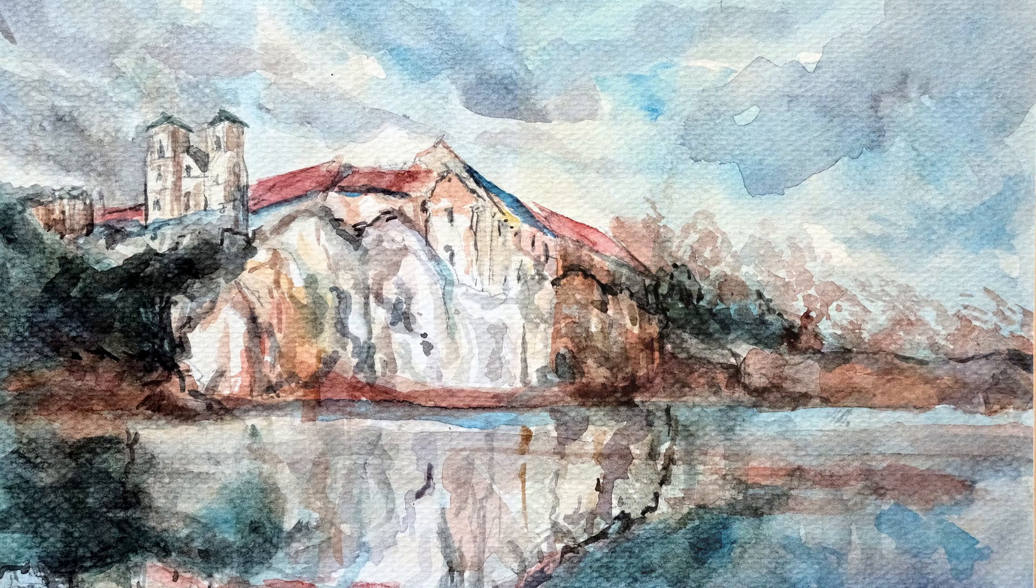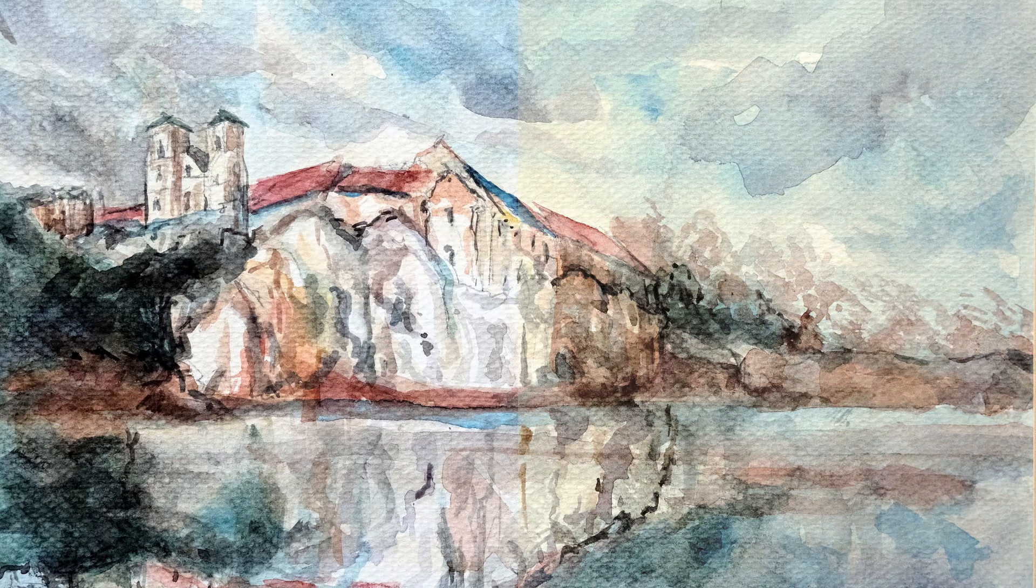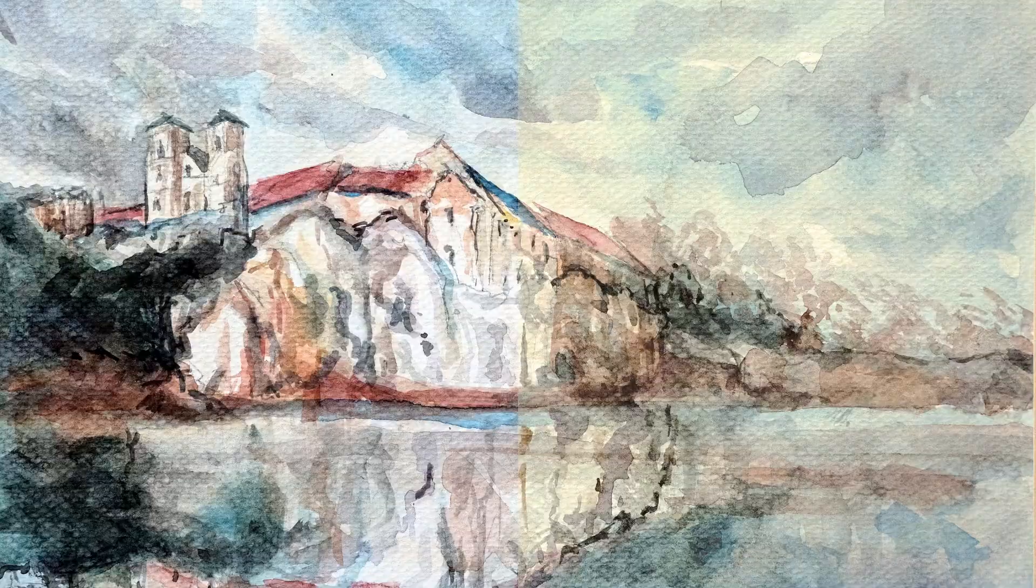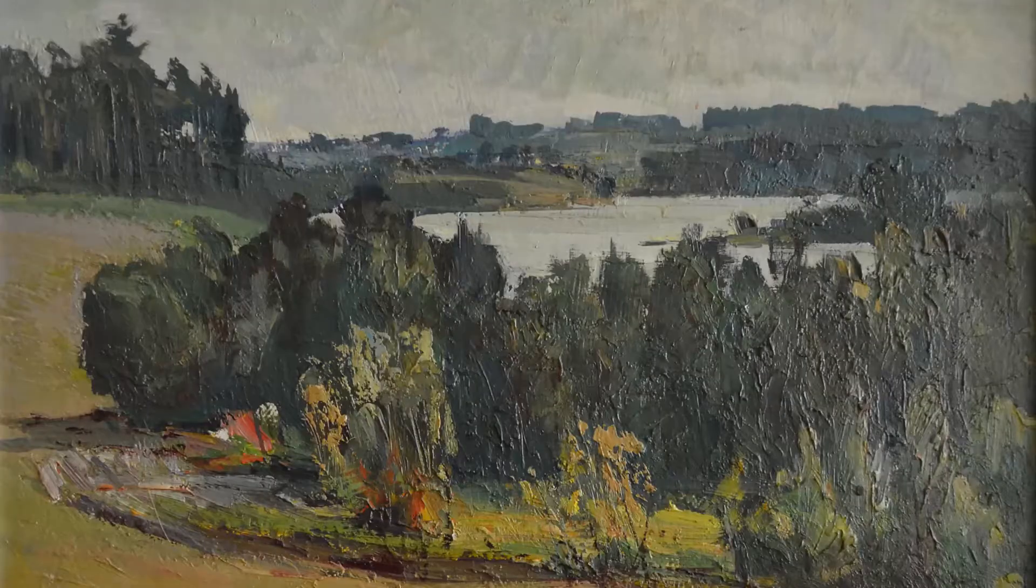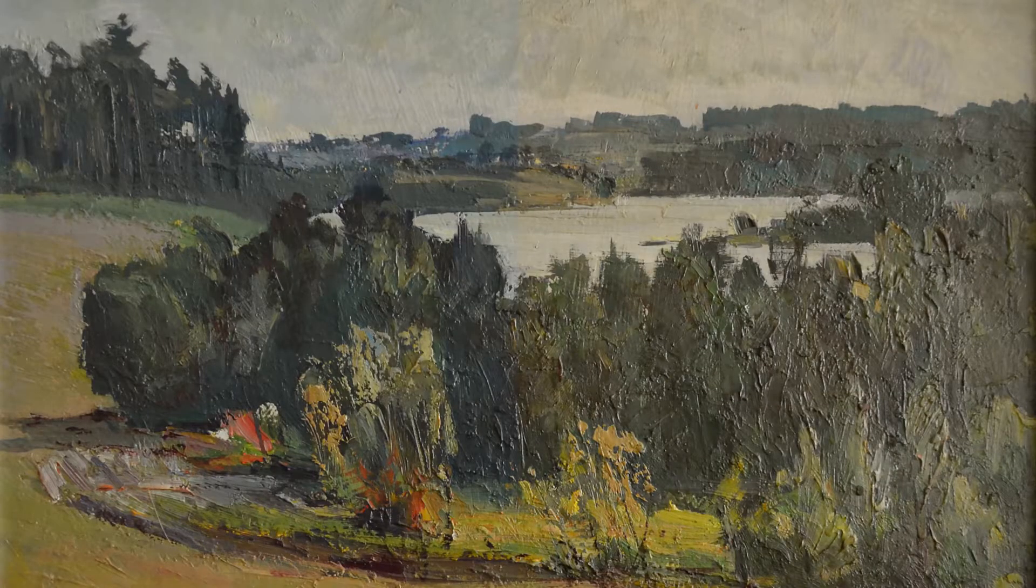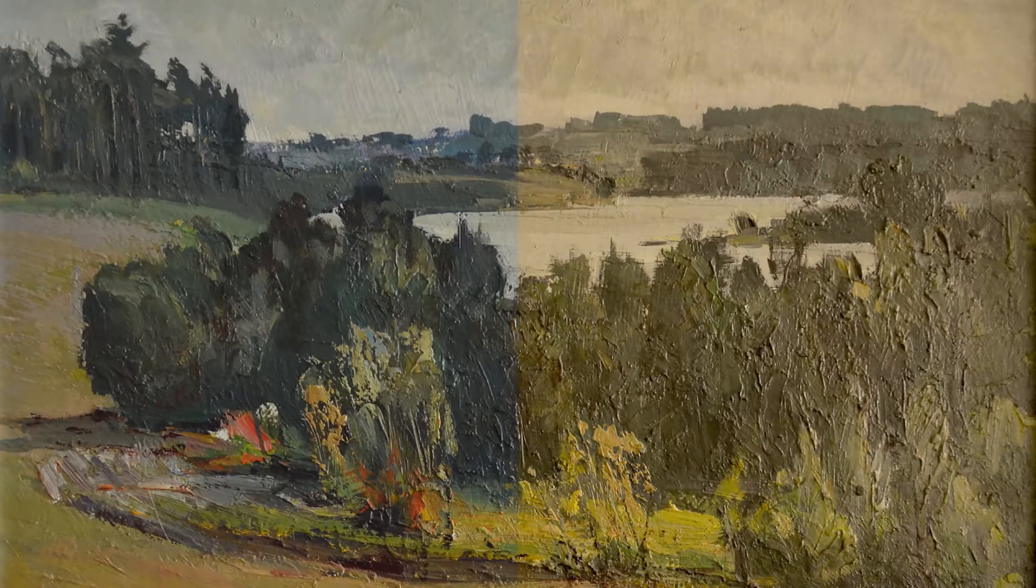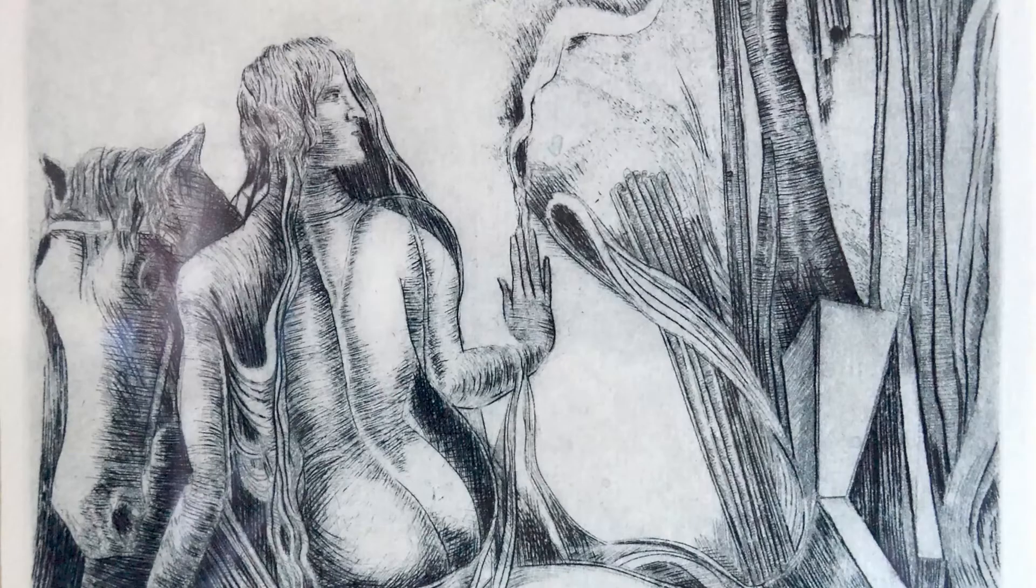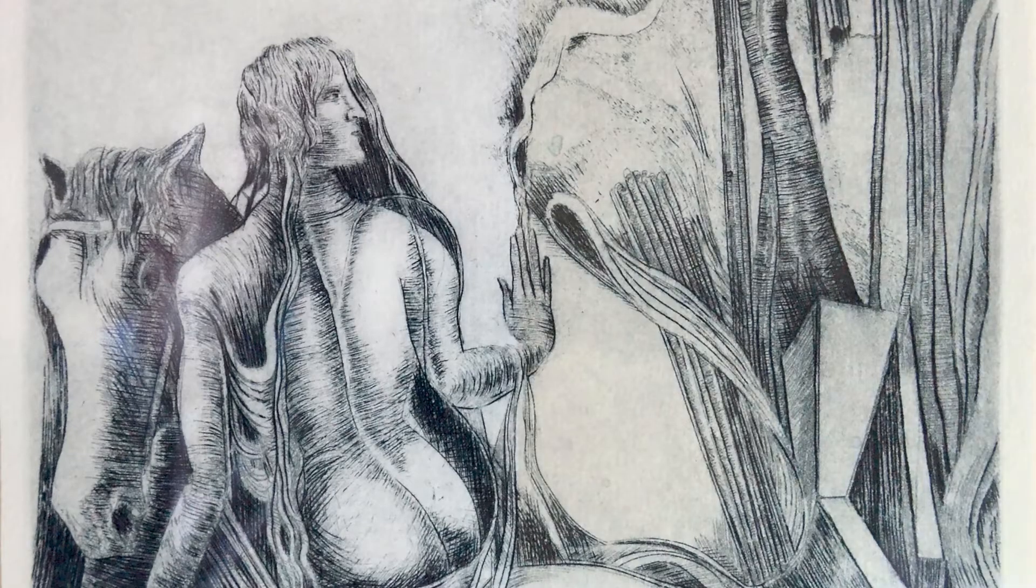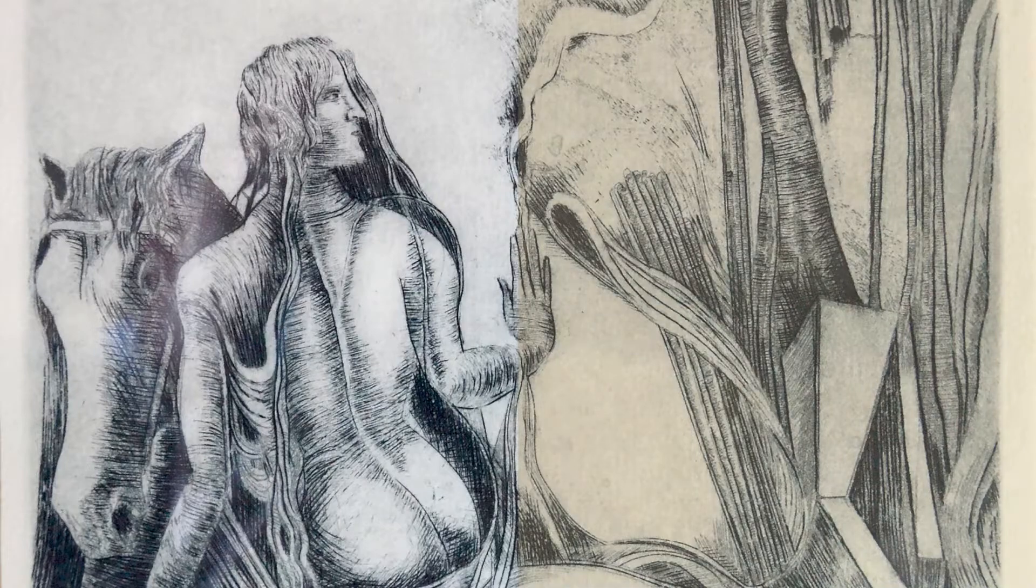Colors often fade when exposed to light. Why do paintings, manuscripts, and other heritage objects need to be protected against fading? To preserve them for future generations.